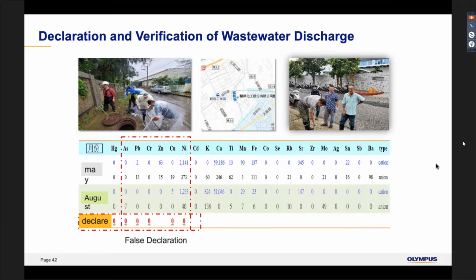So another question, Prof. In order to get the right result, we also have to use other methods to analyze them, and put the result in the table for finding the K factor, right? Sorry, can you repeat?